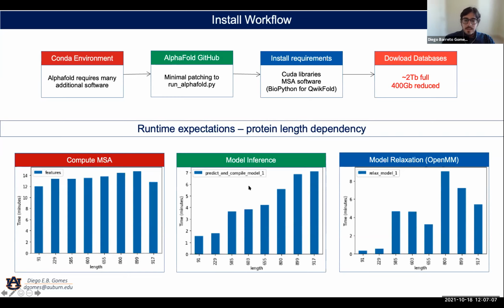Second, and this really depends on the GPU you have, to infer a model, it has to read its model parameters and then use a lot of computations that depend on the system size. When I go from 90 to 900, it changes a lot, almost linearly.